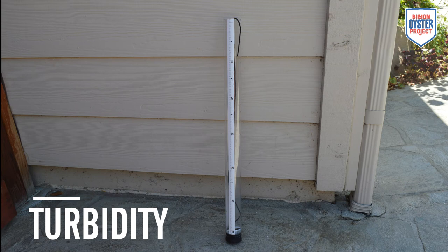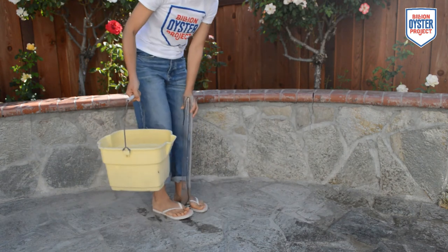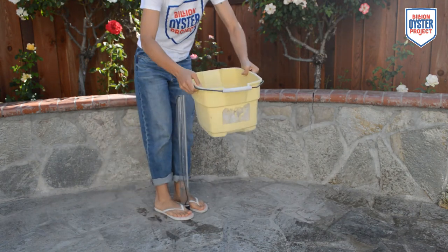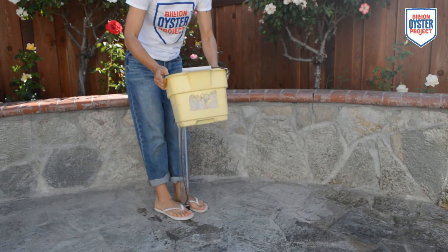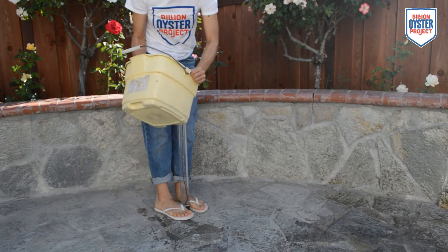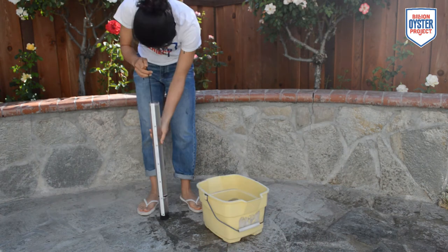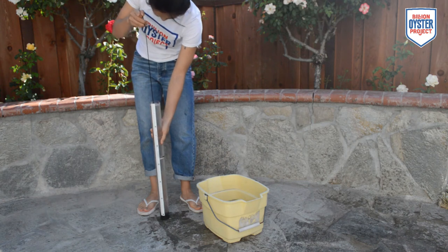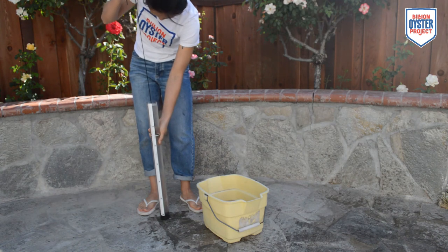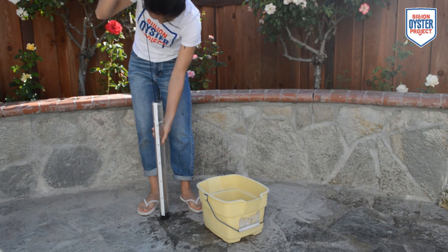To measure turbidity, we will be using a turbidity tube. Fill up your turbidity tube with water from the bucket. It usually helps to have one person hold the tube while another pours water from the bucket, or you can try to do it solo — although you will probably get splashed, hence the flip-flops. For this specific turbidity tube, the black and white circle within the tube, also known as the Secchi disc, can be manipulated by pulling the attached string. Other turbidity tubes may require two people.